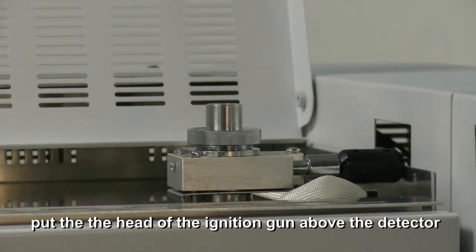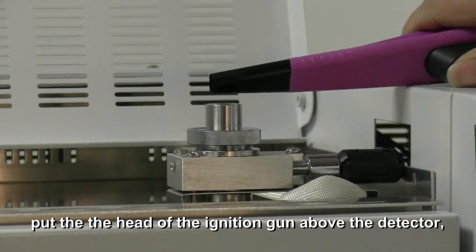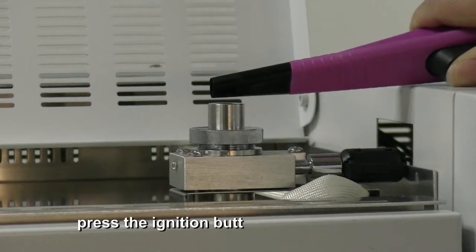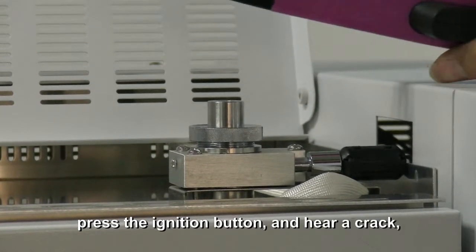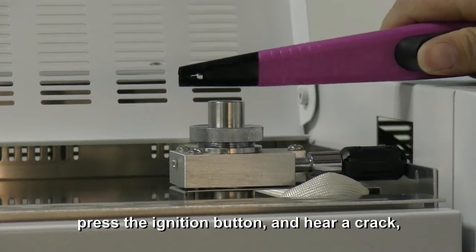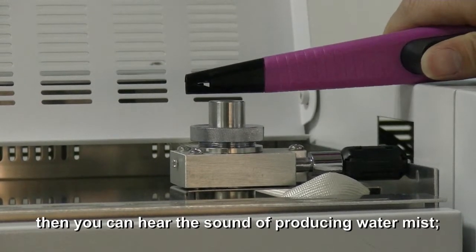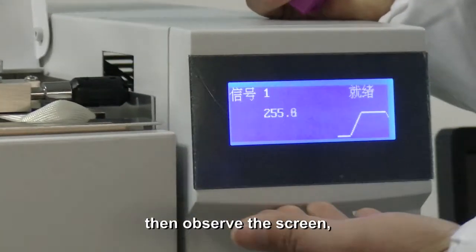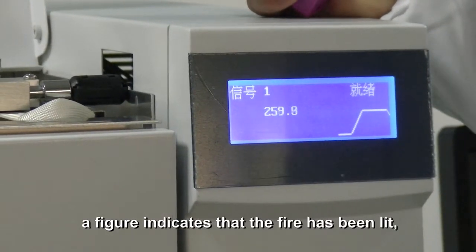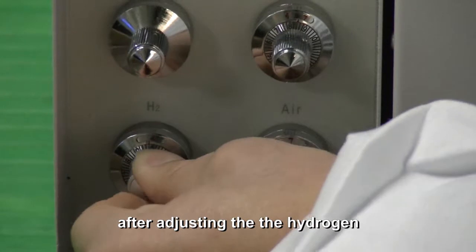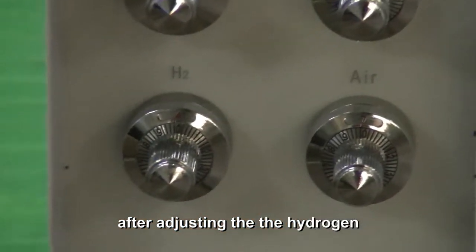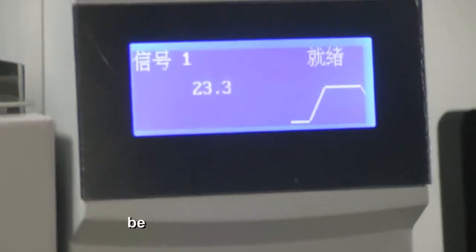Put the head of the ignition gun above the detector, press the ignition button, and hear a crack. Then you can hear the sound of producing water mist. Observe the screen—a figure indicates the fire has been lit. After adjusting the hydrogen flow to required testing condition, the screen figures become significantly smaller.